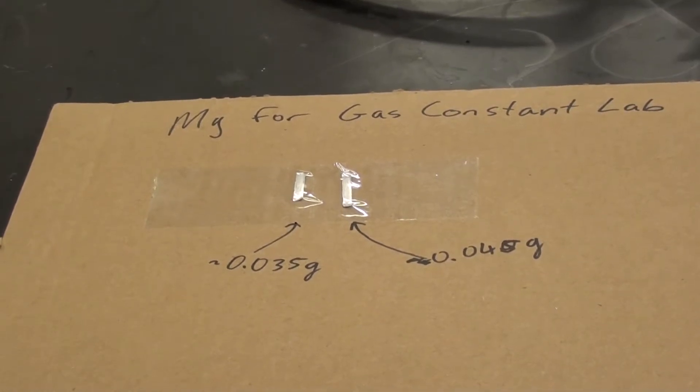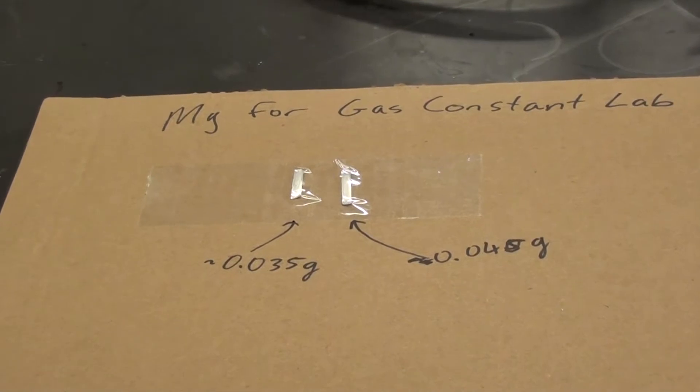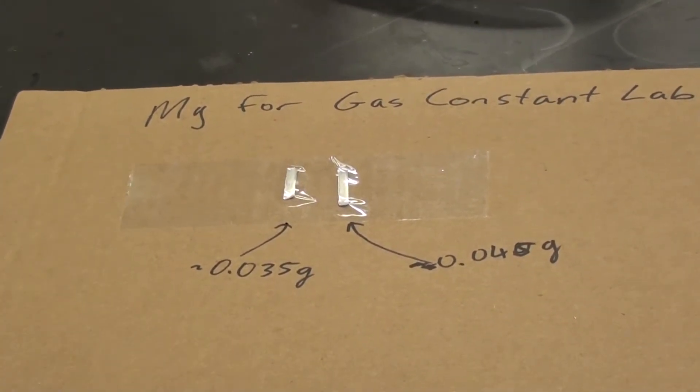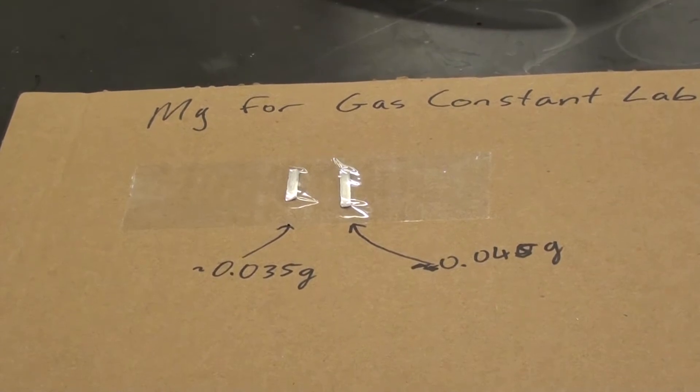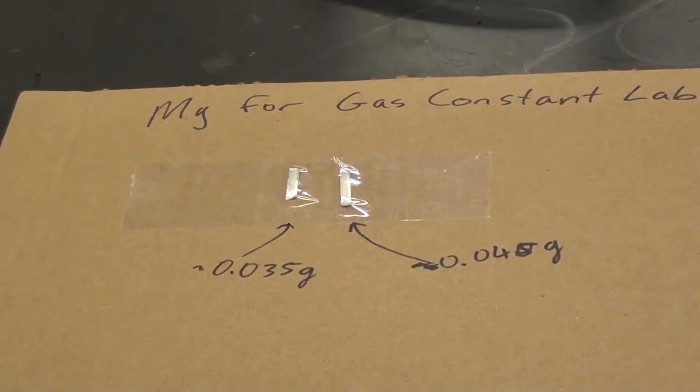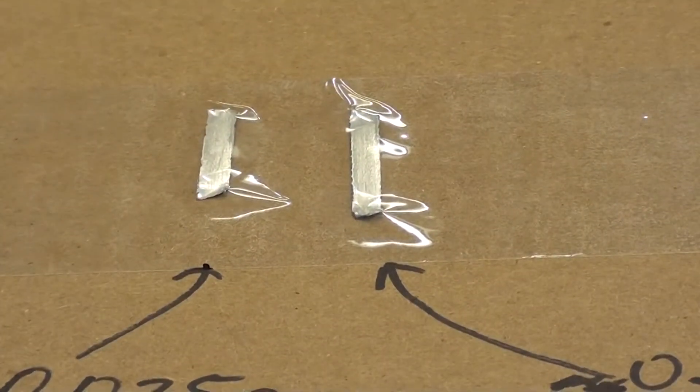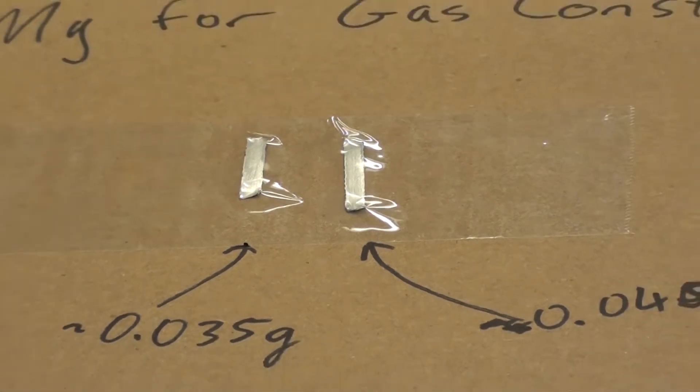This is a setup for the gas constant lab. The first thing we'll be doing is measuring out a piece of magnesium. I've got attached to this cardboard a length of magnesium that weighs about 0.035 grams and another one that weighs about 0.045 grams. We want the mass of our magnesium to be somewhere in between there.